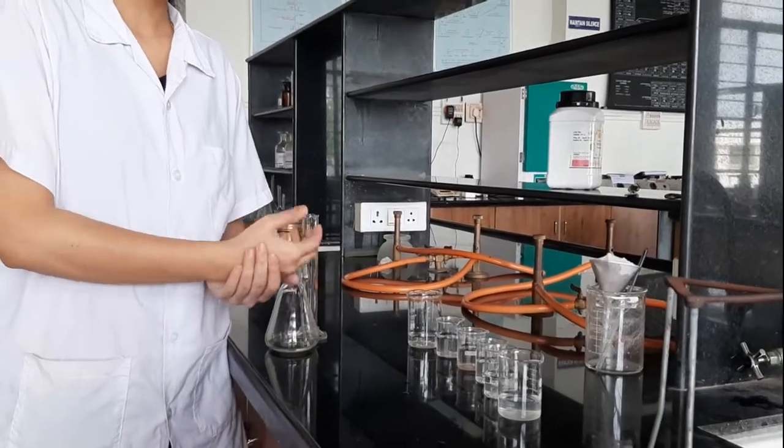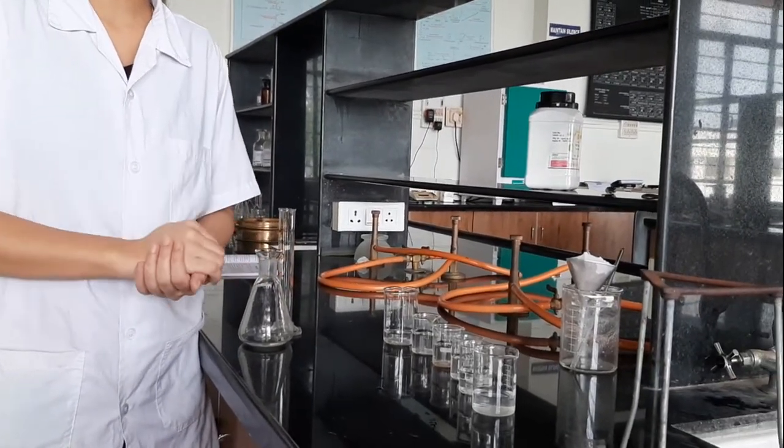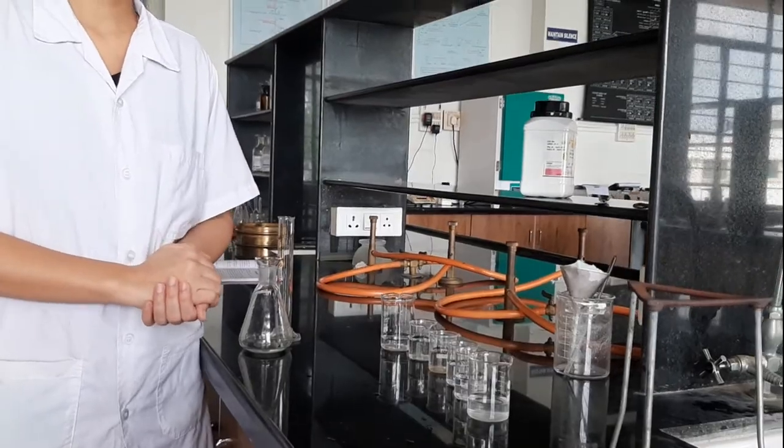After 10 minutes, we will take out the sample and measure its particle size.